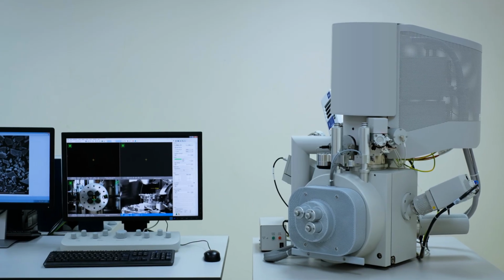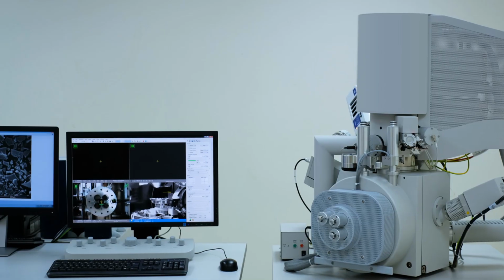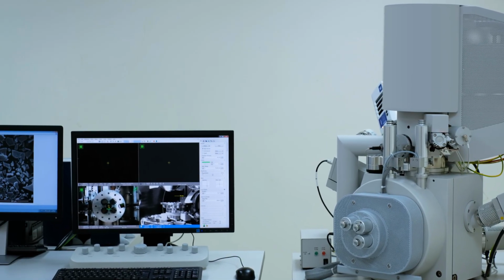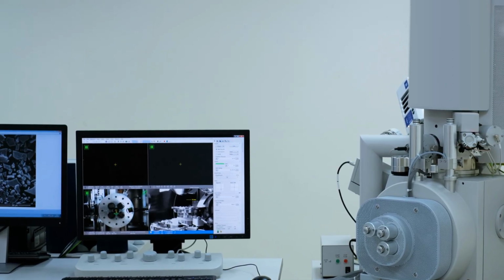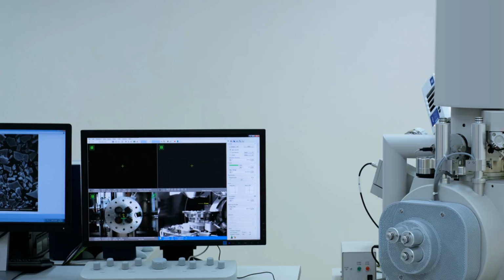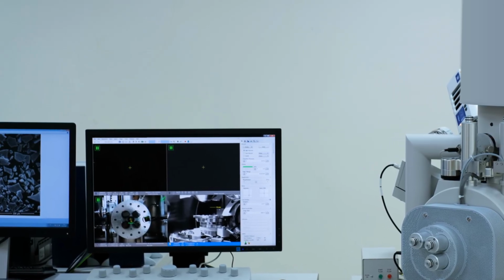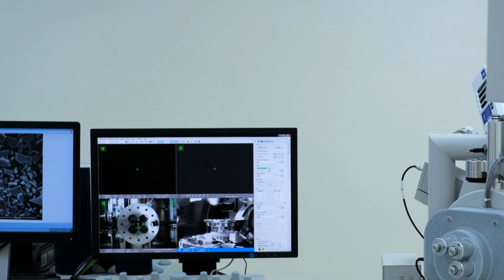Powerful software can stitch together thousands of images to create a huge, detailed map of an entire tissue sample. Furthermore, artificial intelligence is now being used to analyze these massive data sets, automatically identifying cells, spotting signs of disease, or tracking particles as they move. This automation speeds up research immensely and reduces human error.